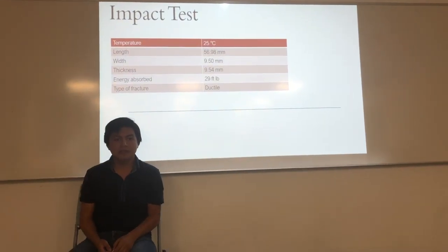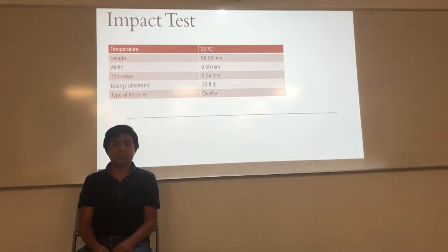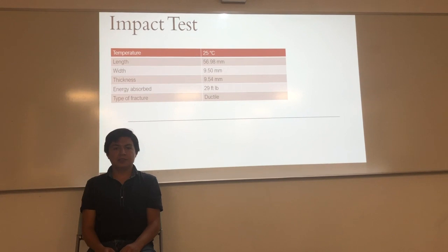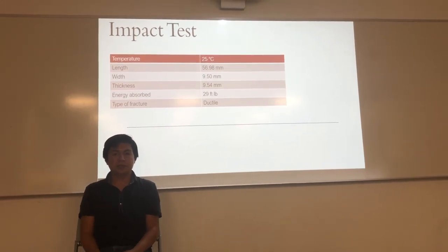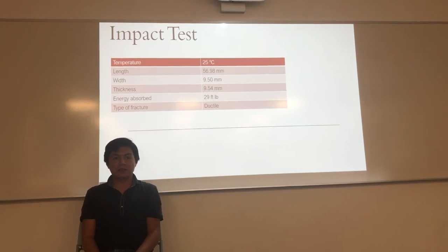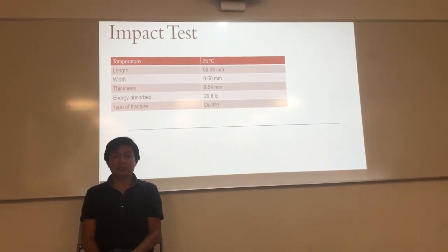Well, I think that this energy absorbed is actually low because when I was doing the test, I noticed that the slot of my piece was a little bit too big, and I'm pretty sure that it absorbed less energy than it should.